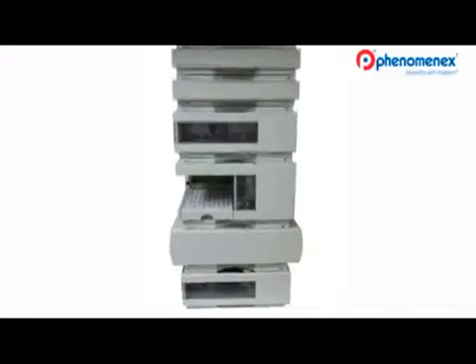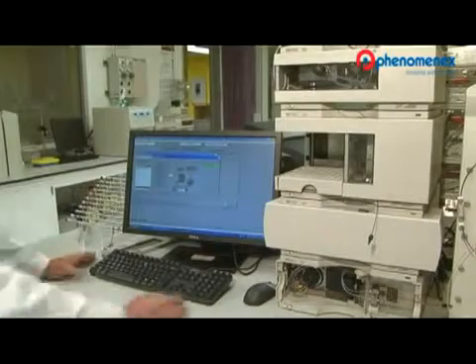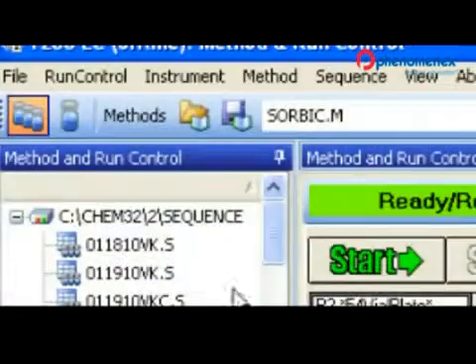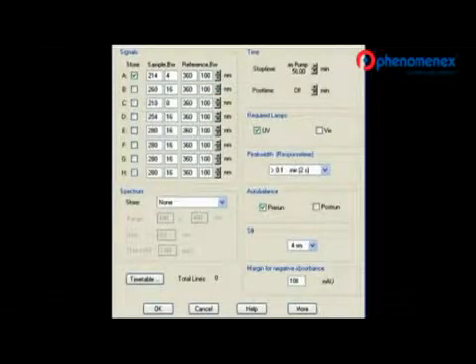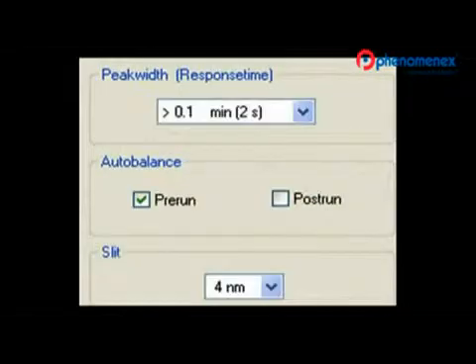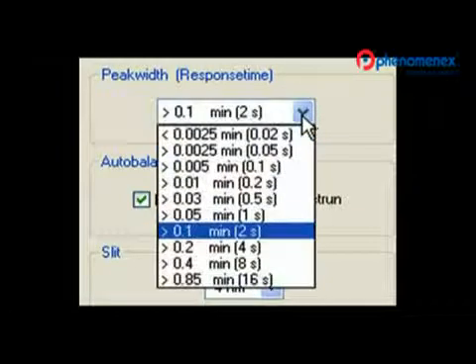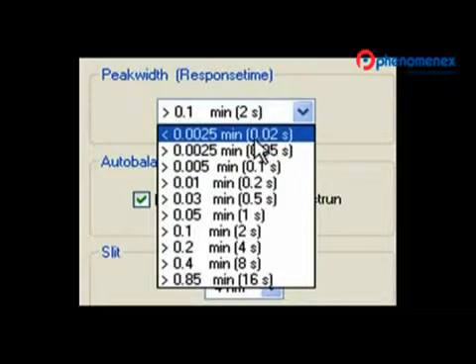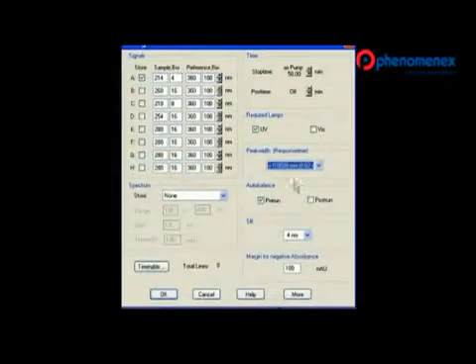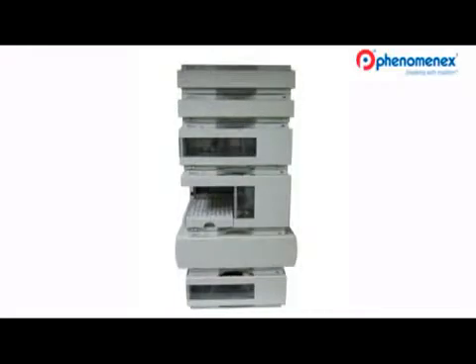Now let's go to Phase Two system optimization. Phase Two focuses upon simple detector improvements that allow the detector to perform at a higher level. First, you are going to change a software setting. In the main instrument window, select the setup DAD signal option. Within that window, change the peak width response time to the fastest acquisition rate possible — this will vary depending upon the detector type. In this case, we are increasing the response time from 2 seconds to 0.02 seconds, a 100-fold increase in data acquisition rate. Then just hit OK and you are done — this is a simple change, quick and cost nothing.